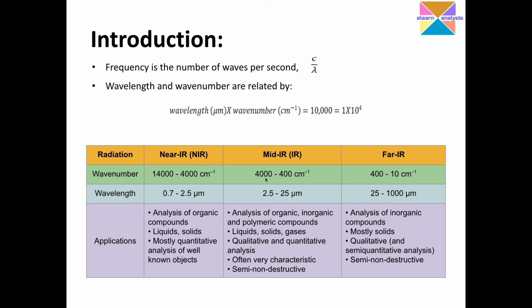So the mid-IR region, as I mentioned, is the vibrational region which I am very much interested in, and throughout the discussion we are taking up this mid-IR region. We also have the far IR region, and this far IR region will be overlapping with the microwave radiations. So it is not a clear-cut demarcation between these electromagnetic radiations, but there is a sort of overlapping. The red end will be overlapping on this near IR region, and the microwave region will be overlapping on this far IR region.